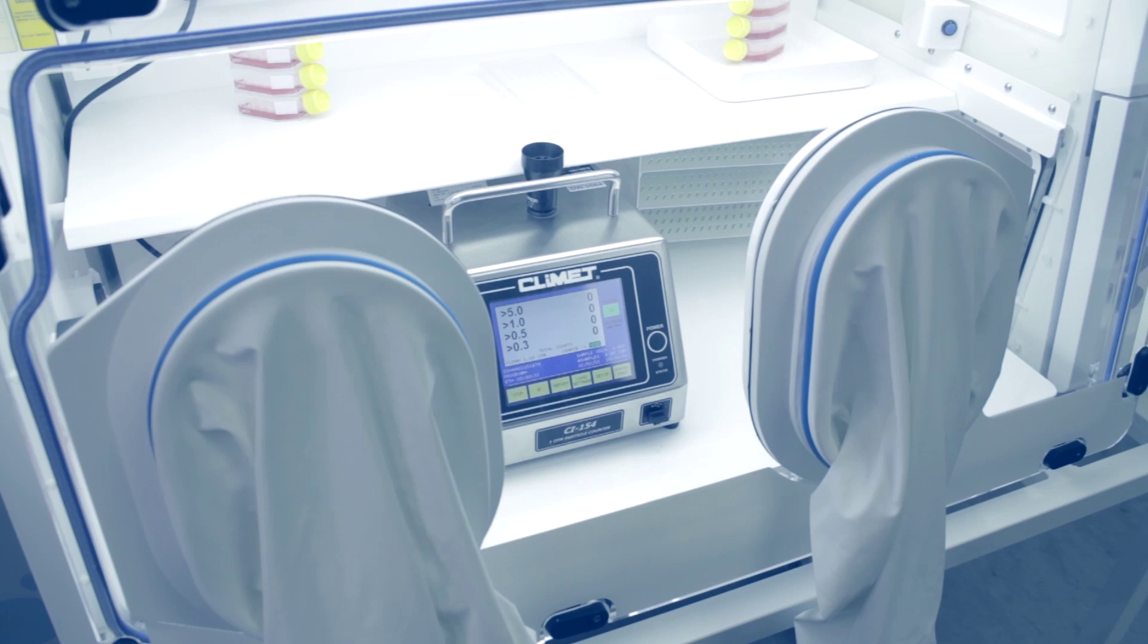The ISO 14644 standard addresses particle counts, but we also wanted to specifically demonstrate the removal of bacteria from the atmosphere of our HEPA workstations. So in our laboratory, we conducted tests with aerosolized bacterial cells and spores and quantified their removal.